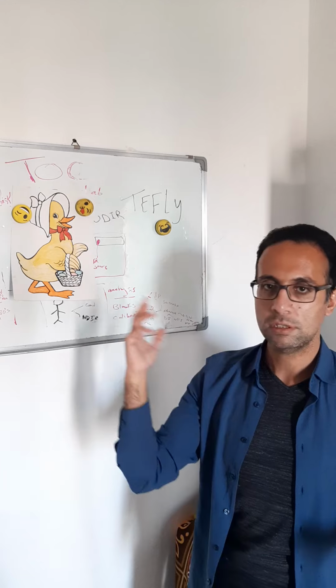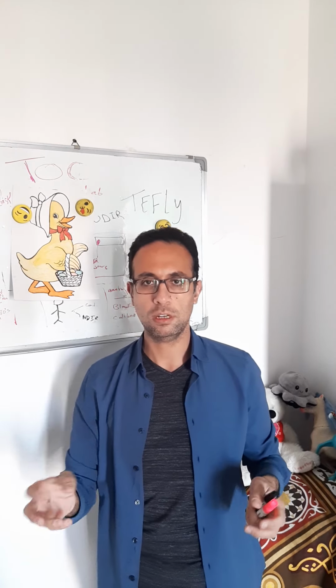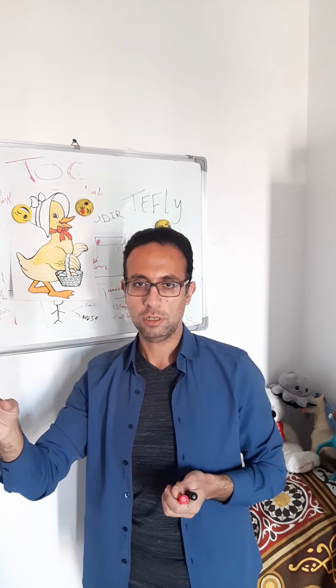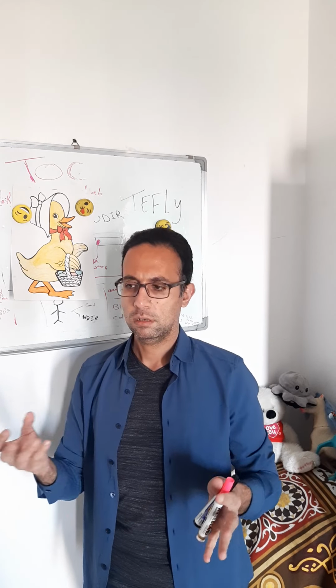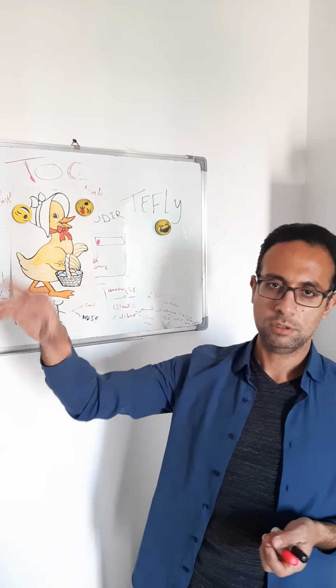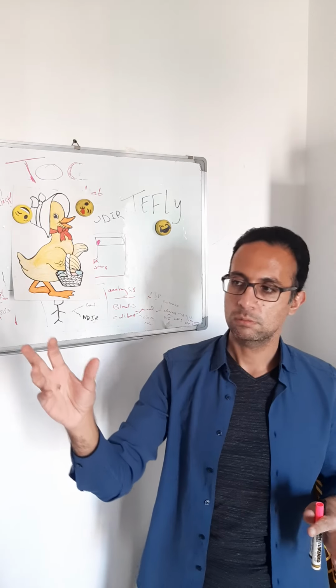For example, in GC, we have many detectors. FID, flame ionization type, which detects using flame. I'm not so specialized in GC, but as I know, GC detects specific compounds using flames. Of course, GC has a thermal program like that, but I'm trying to make something close.